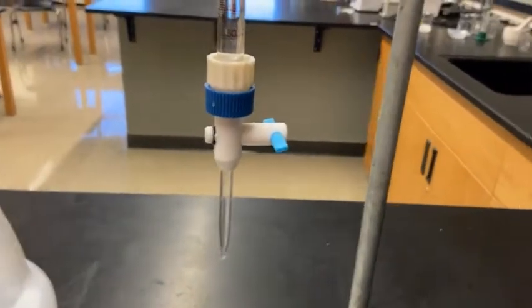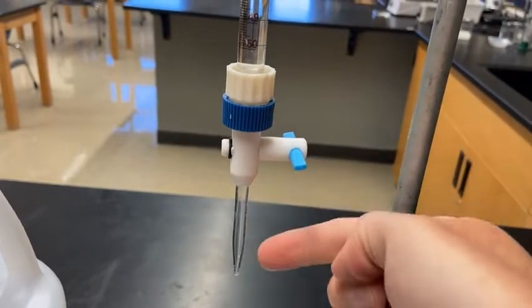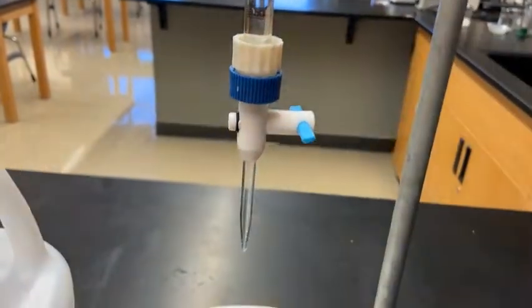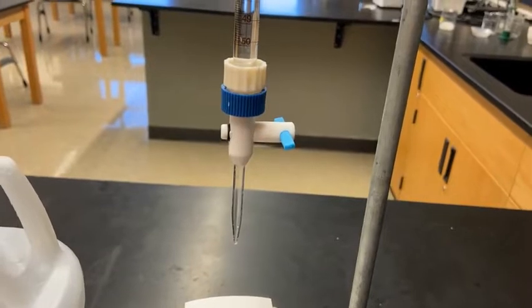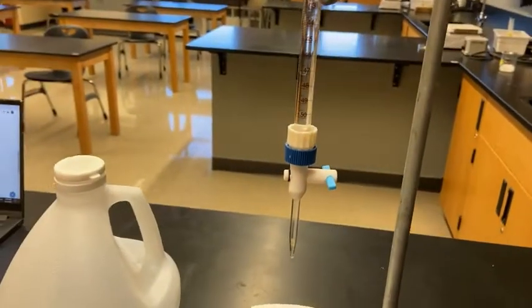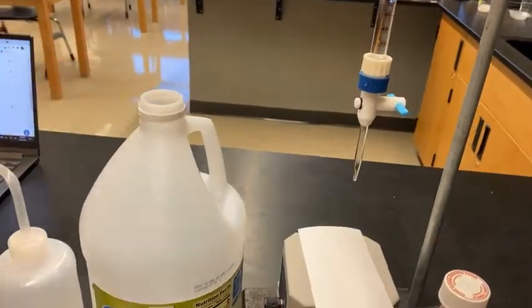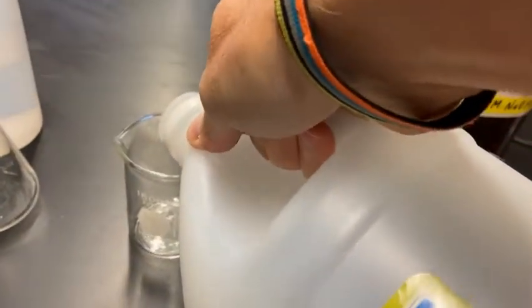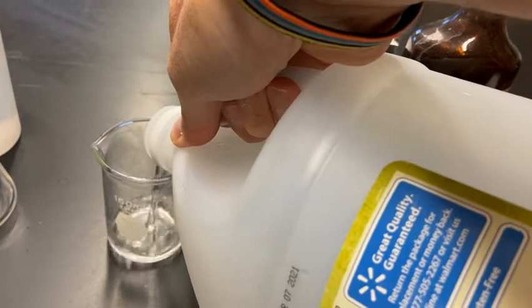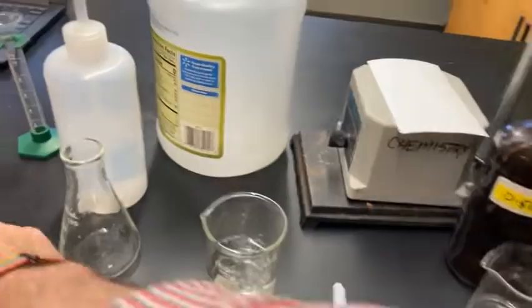The liquid will flow out of the tip of the burette, and I'll be turning the stopcock to dispense the sodium hydroxide into the vinegar. Now we're going to get our vinegar ready. I'm going to pour some vinegar into the beaker so it's easier to work with, and then use a volumetric pipette to draw out exactly 10 milliliters.